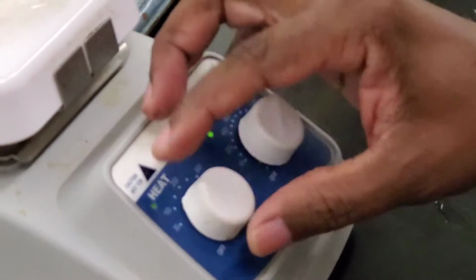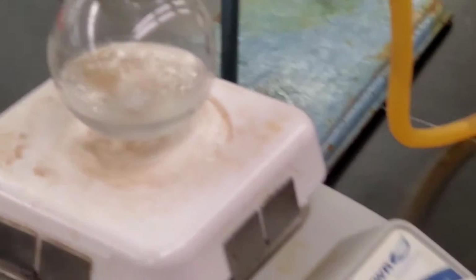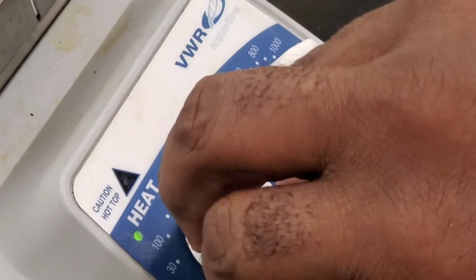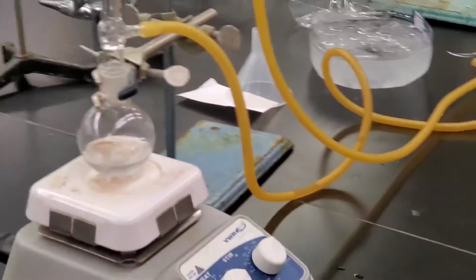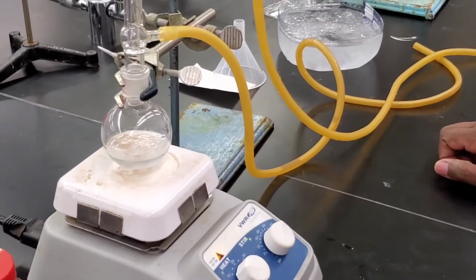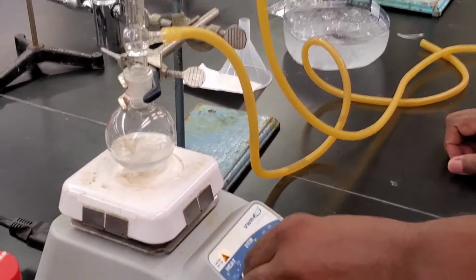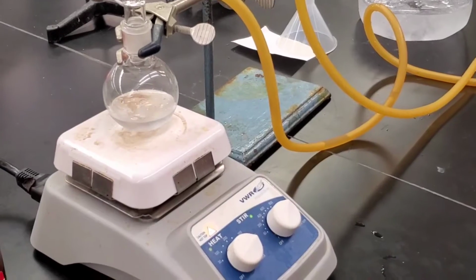You start heating this. When you're doing a reflux, you always turn up the heat. I would say most of these go up to like 500. Turn it up to at least 400. Okay, turn it up high. Don't turn it up to like 100 and then slowly go up. That's wasting time. You basically turn it up high to at least 400, 450.